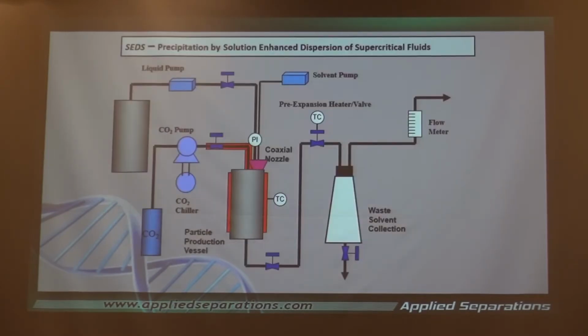I'm going to move past SEDS, because that's really another coax nozzle, and now we're using water to dissolve into a solvent into the CO2. It's just on and on, more of the same thing.